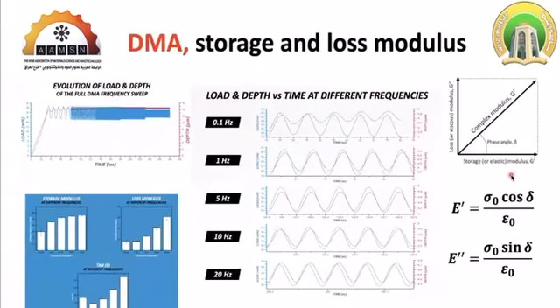Another important mode for nano indentation. I'm going very quickly through the applications of nano indentation because of the limitation of time. It's only 1 hour. For further information, you can contact me, or I can send you some extra literature to get more information. So DMA. I guess everyone knows DMA.